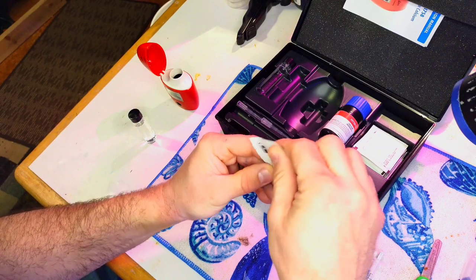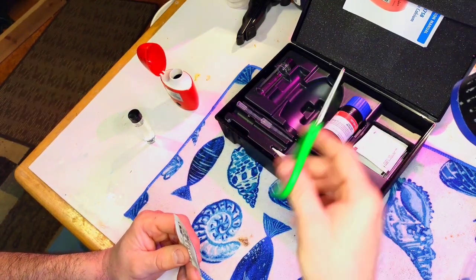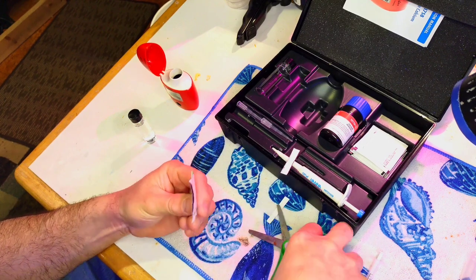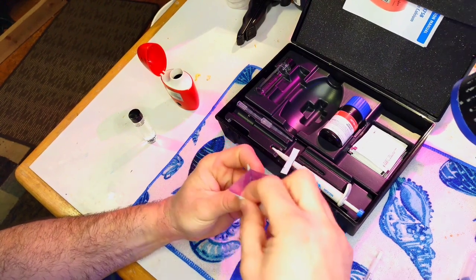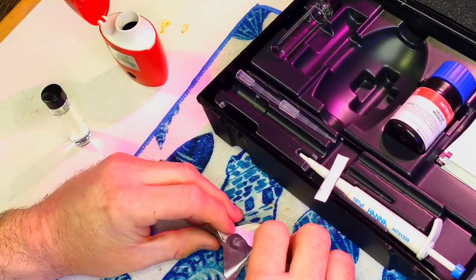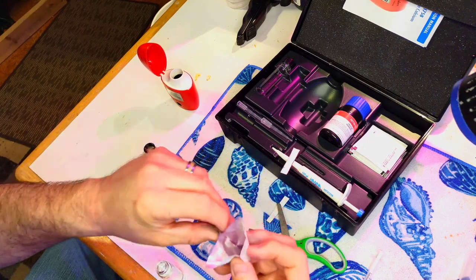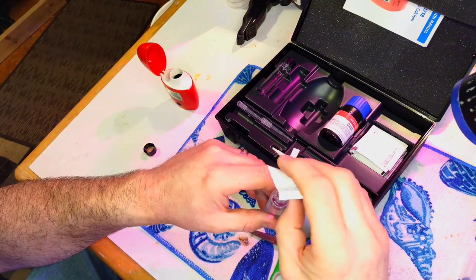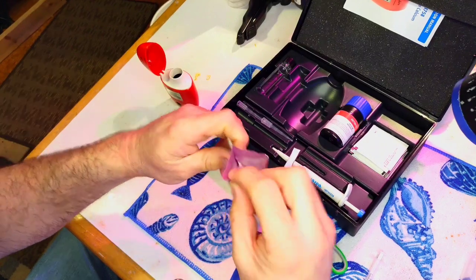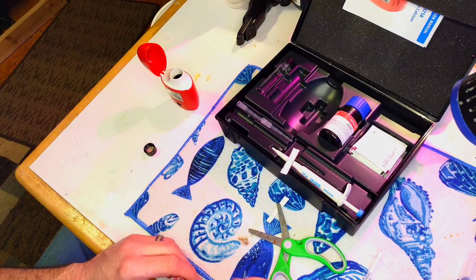I like to flick the reagent packet to get everything down into the corner so when you cut it, none goes flying. I keep small scissors in my kit so I don't lose them. Cut it open, then fold the packet and stick it into the vial. Try to get all the reagent out — tap it around to empty it as completely as possible for the most accurate reading, then set it aside.